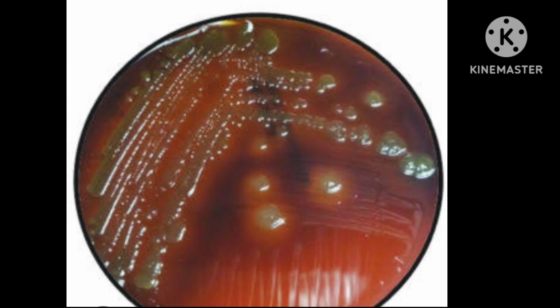Hemodigestion means some bacteria like Vibrio cholerae produce some metabolic byproducts which cause a non-specific destruction of blood cells. This may be observed more around confluent colonies and may not be seen around individual colonies at times.